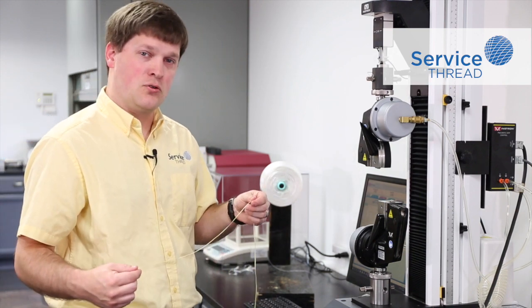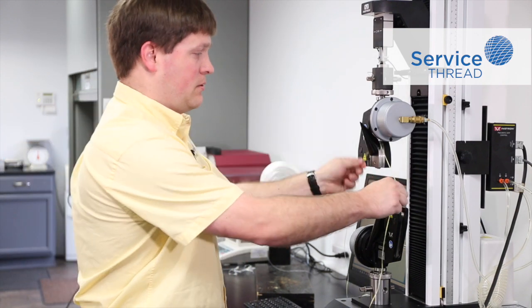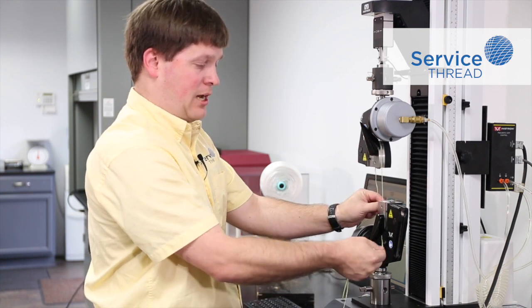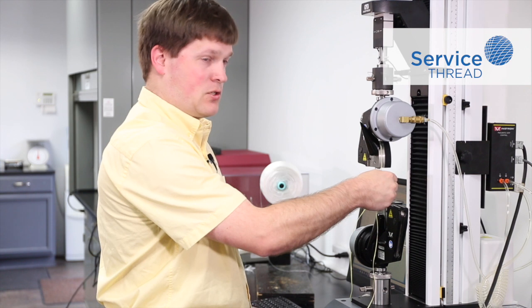The first test is going to use flat yarn. Just like before, we secure the yarn in the top grip and the bottom grip, and the machine starts automatically.